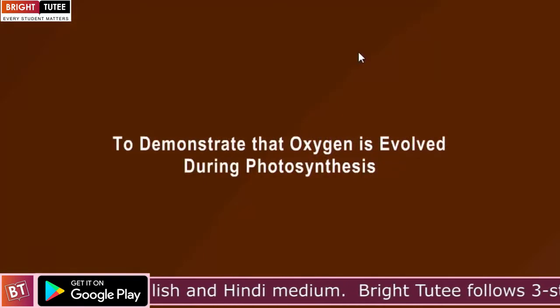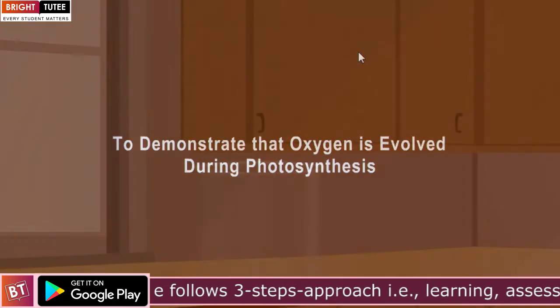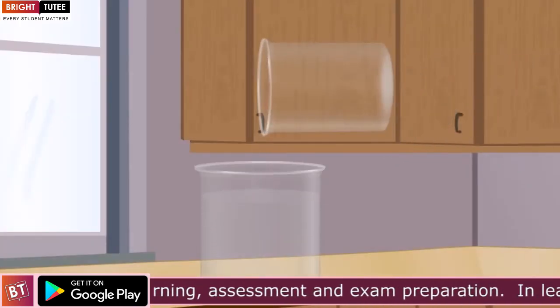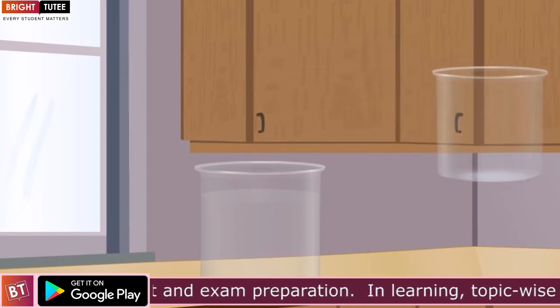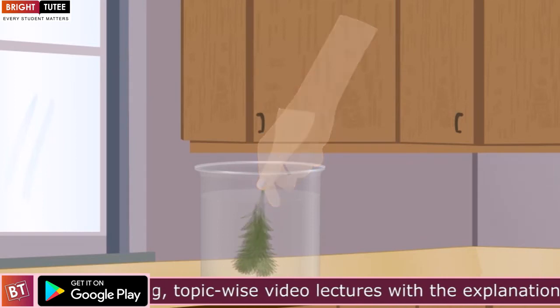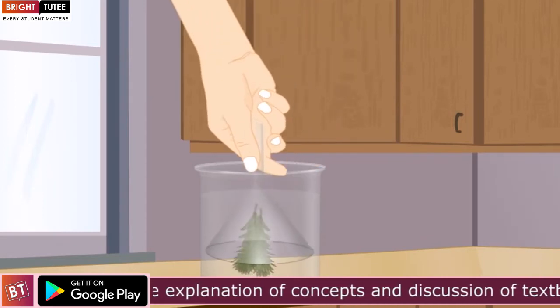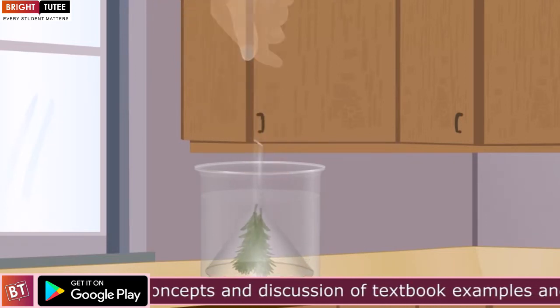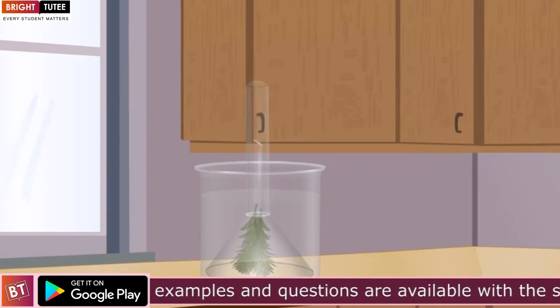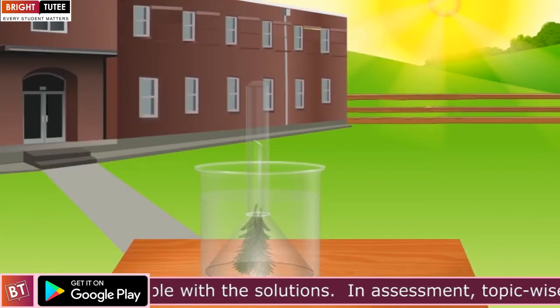To demonstrate that oxygen is evolved during photosynthesis, take a beaker and fill 2/3 with water. Now cut some twigs of hydrilla underwater and place them in the funnel with cut ends arranged to the stem of the funnel, just as shown in this figure. You have to keep the hydrilla in the funnel and put inverted funnel in the beaker and a test tube over it.